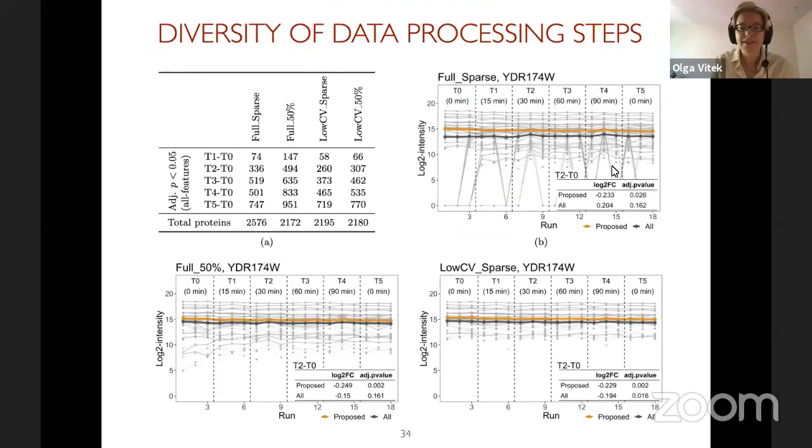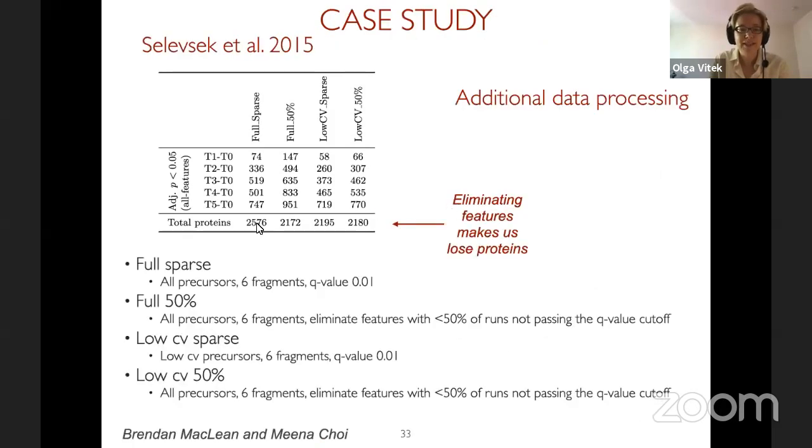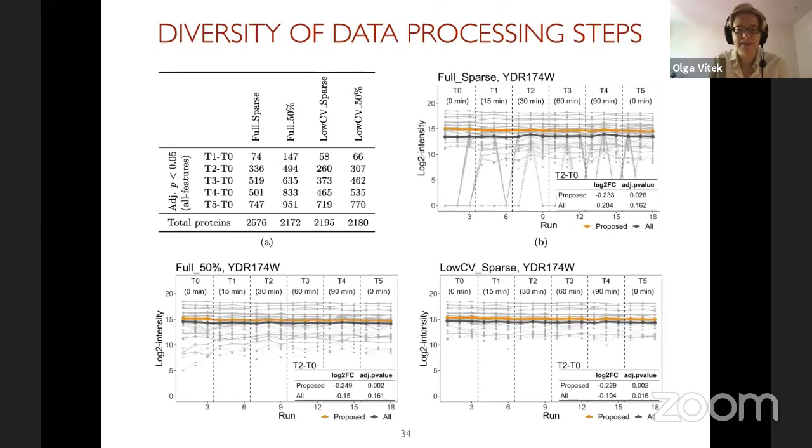And so this is what these things look like. Clearly the profiles look very different if we do that. Again, if we keep filtering, we lose proteins. So it may look like a bad thing.